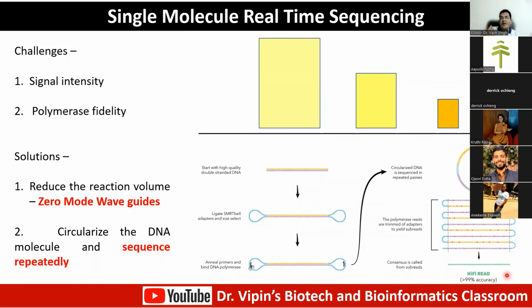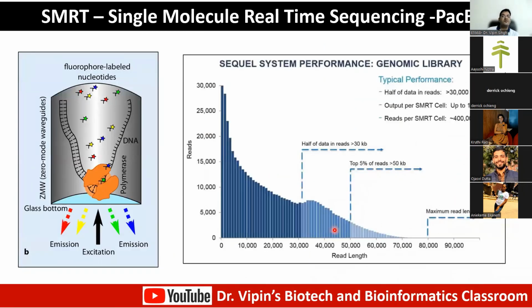So you have overcome the two basic problems with single molecule sequencing. One was the signal intensity, solved by creating zero mode waveguides. And second, you circularize your DNA and sequence it multiple times. So if there is a problem with respect to the fidelity of polymerase, you're still looking at a consensus sequence. The nucleotide that appears most commonly at a given position is your final sequence. This gives you high accuracy, and these are known as the hi-fi reads. So this is your system here.